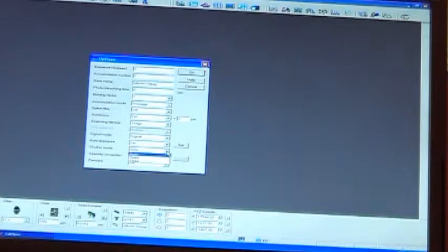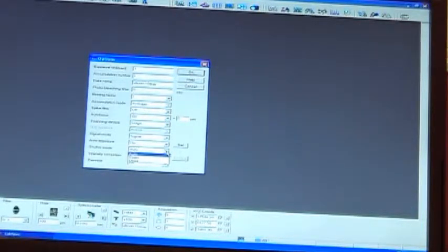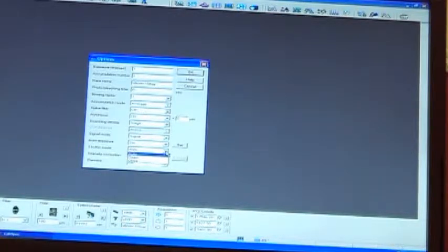You should hear the shutter chattering inside the system because there's no power going to it. Or if your shutter is not responding, someone in this options window could have altered the shutter mode to either fully open or fully closed. Fully open is not too bad for CCD, that is fine.